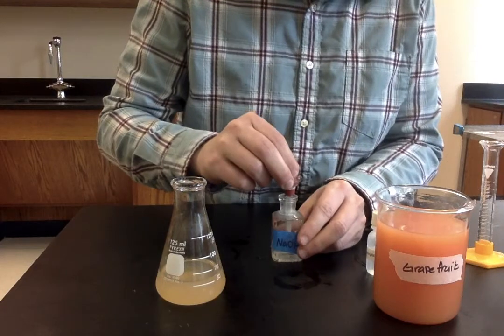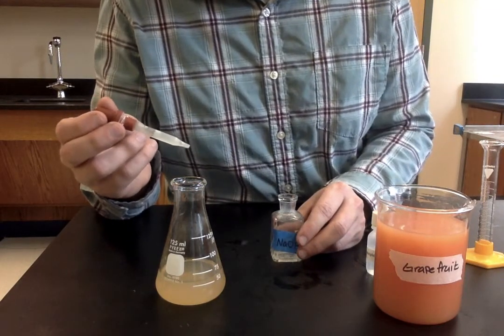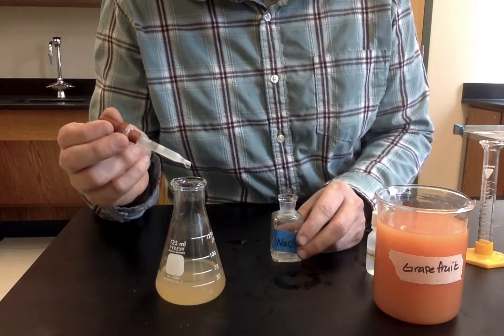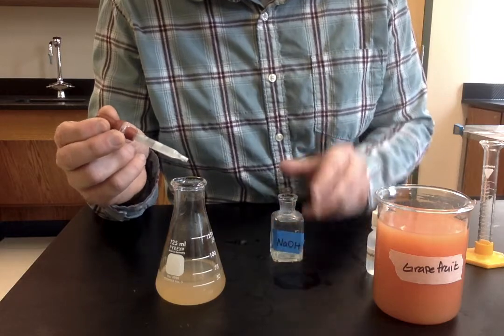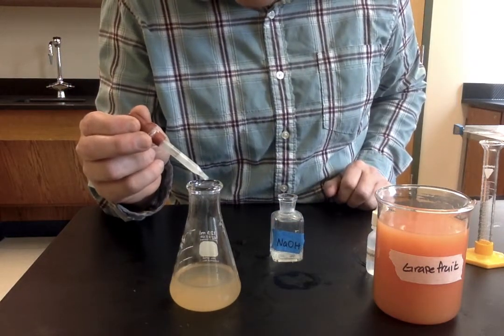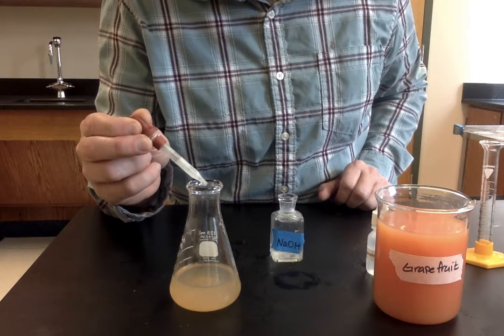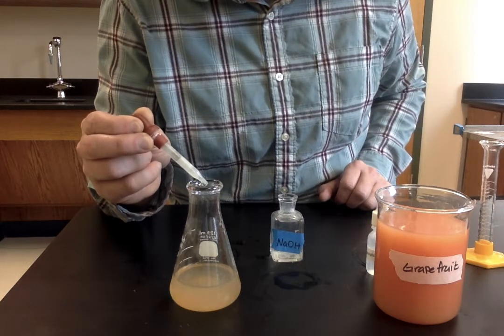Okay, here we go. Again, you should see — if you look at the top here — with each drop, a little bit of color being added to the top of the solution.